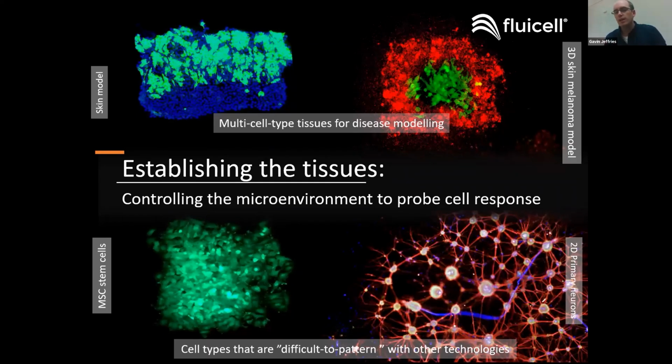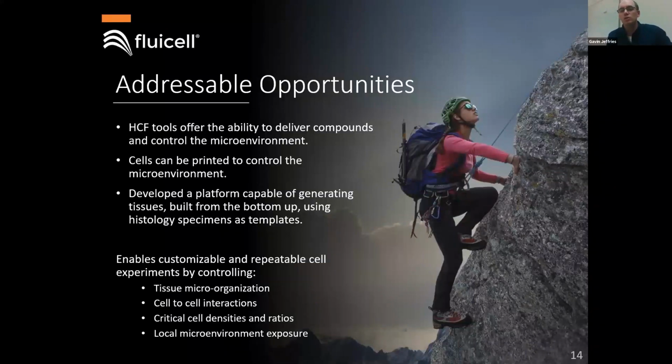So these can all be essentially studied so that you then have a patterned system that you can then interrogate using other electrophysiological or fluorescence techniques. This gives you the control to build your system, as opposed to just allowing the cells to be where they are.